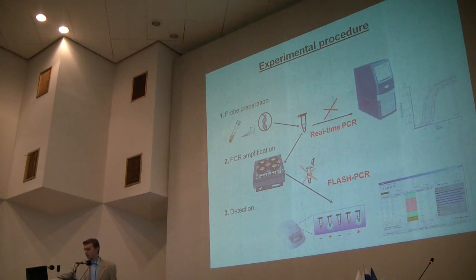Experimental procedures include three main steps: probe preparation, PCR amplification, FLASH PCR or real-time PCR, and detection of results. In the case of FLASH PCR, detection is after termination of the reaction, and in the case of real-time PCR, detection is during the PCR.